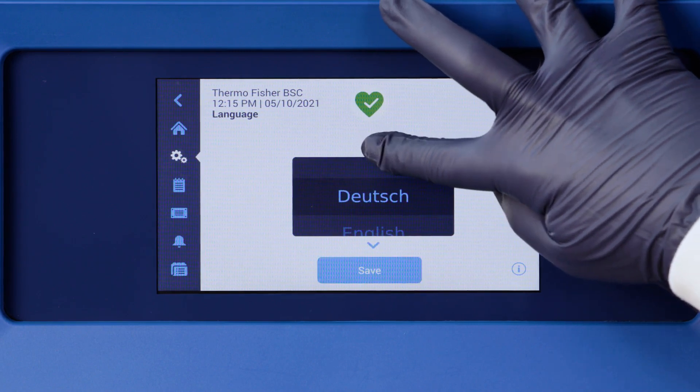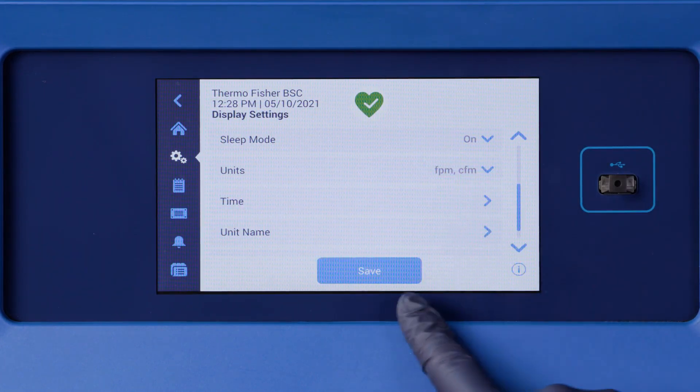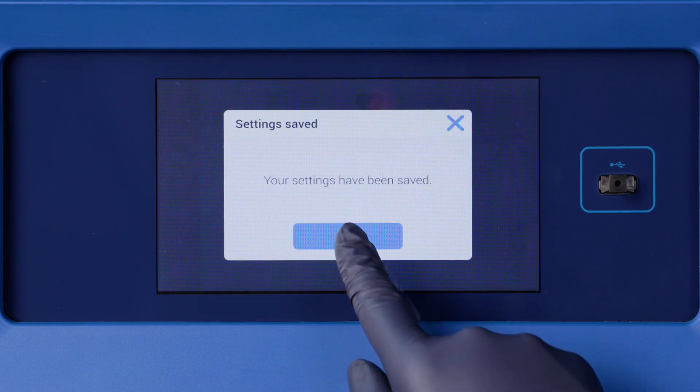This is a marked contrast to the cabinets of old — or the more traditional interface — where you just got a sound and a particular light indicated. The language of this interface is configurable, and you can also select the units most familiar to you, whether imperial or metric.